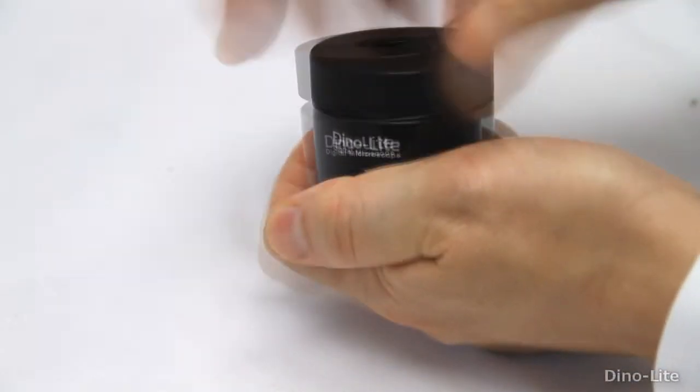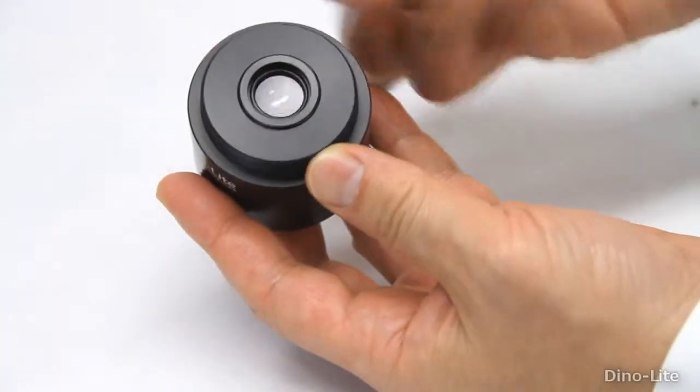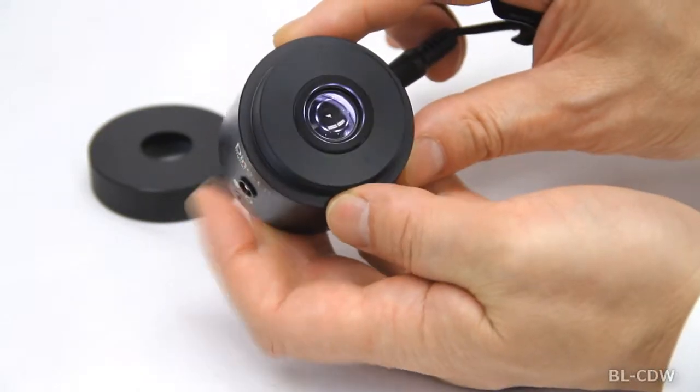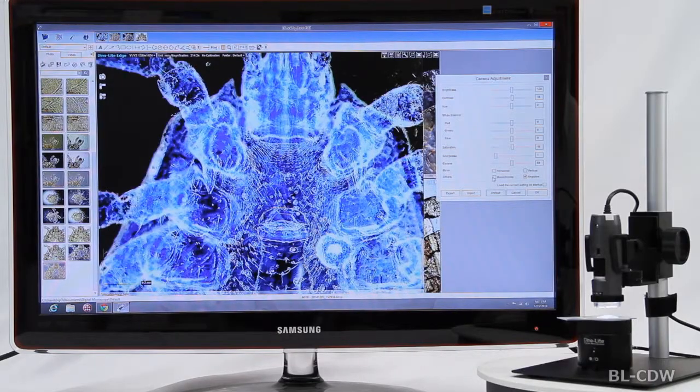The bright field mode of the BLCDW produces a collimated beam of light with no adjustment required, reducing the scatter light which reveals more detail compared to a diffused backlight.